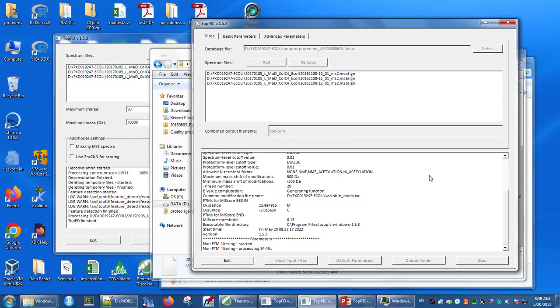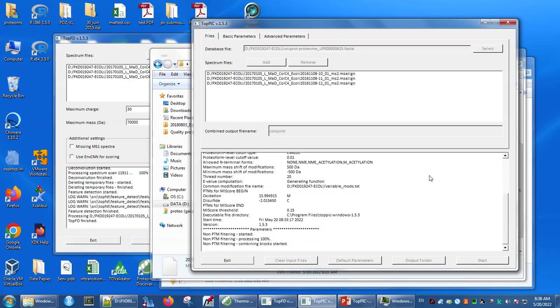One of the things that people don't understand is that we frequently find the limitations to search speed are not just CPU. Instead, the software is doing a lot of filtering back and forth with the sequence database. And that sequence database has a very large number of possibilities. As a result, what we have is a limitation in moving things from the hard drive into memory.